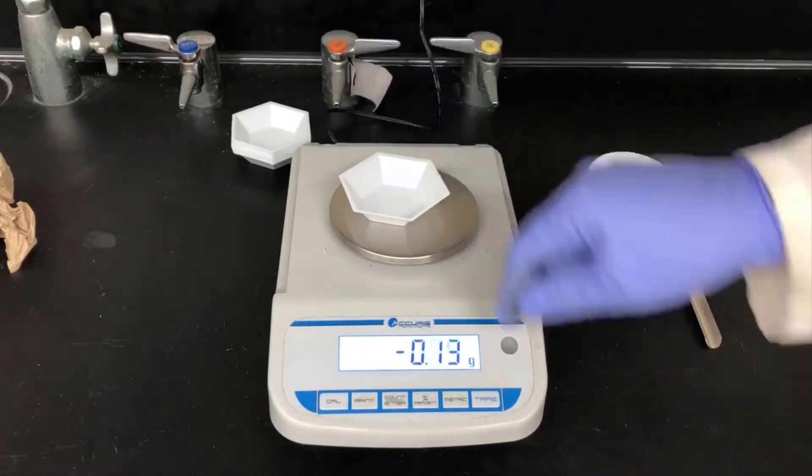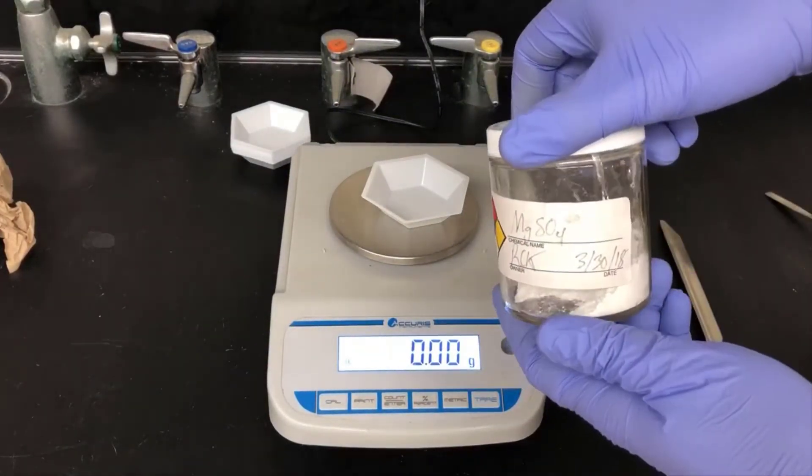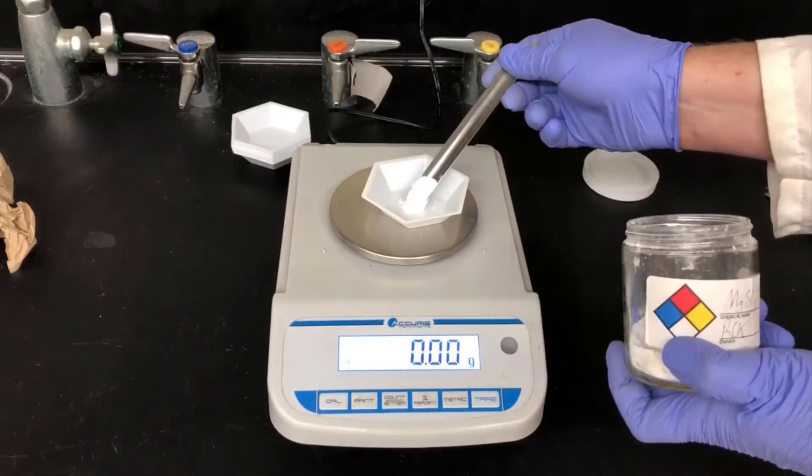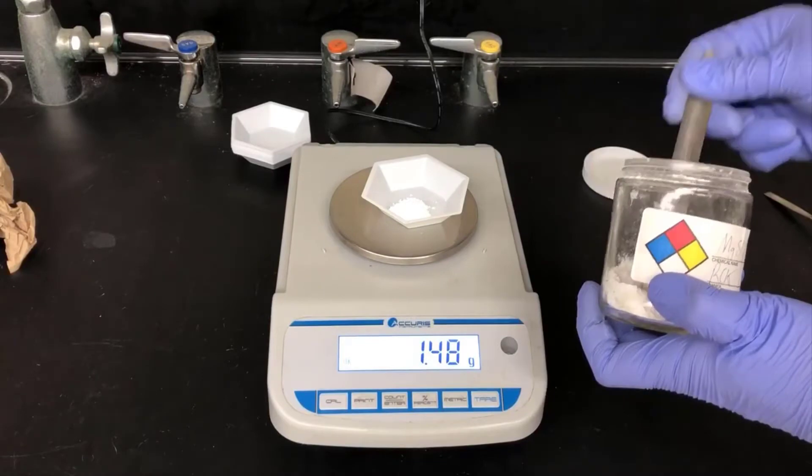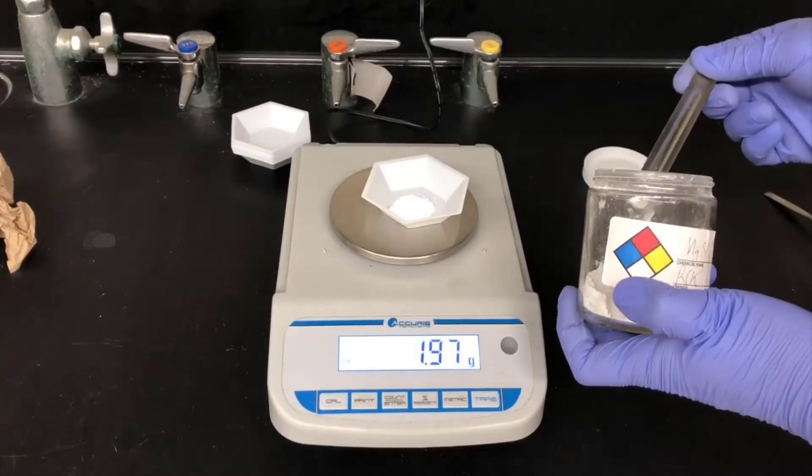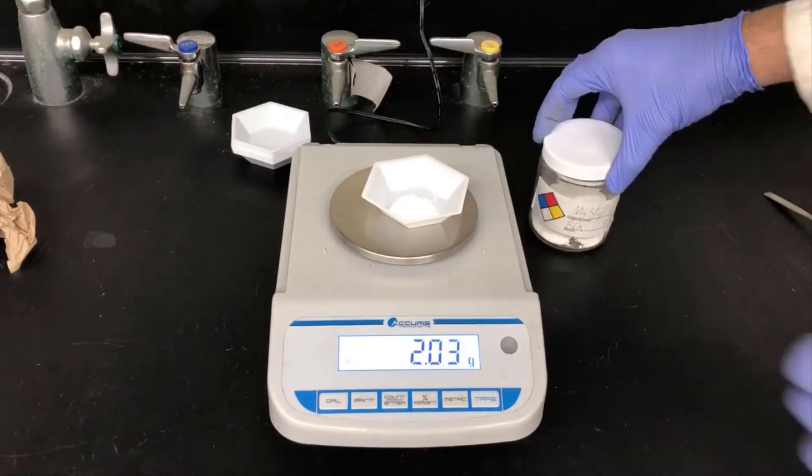Now I'm weighing out some magnesium sulfate, which is going to act as a drying agent. Magnesium sulfate has an affinity for water, and when we add it to the solution of ethyl acetate, it'll absorb any dissolved water that's in that solution. This is important because water causes problems later. I'm weighing out approximately 2 grams here. You don't have to get 2 grams exactly. If you get close, that's good enough.